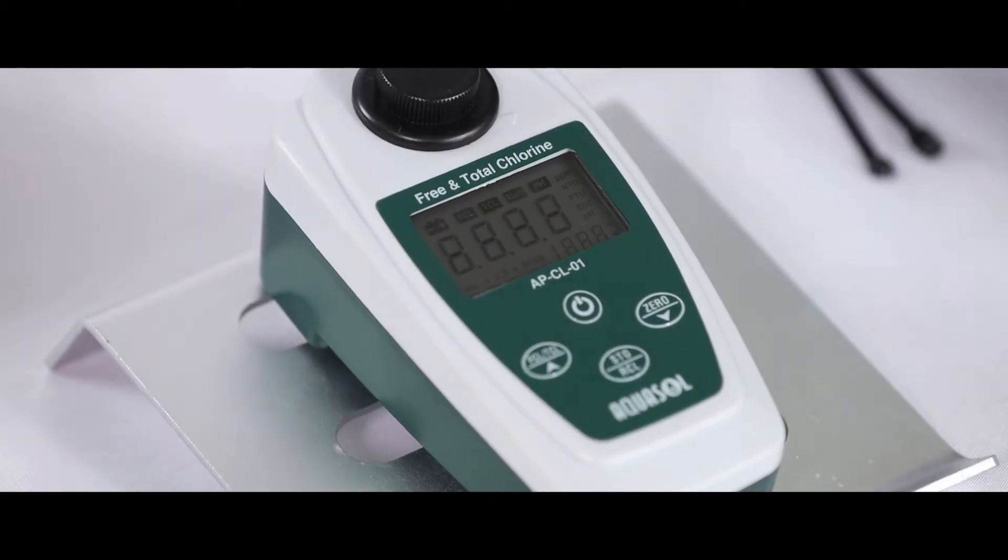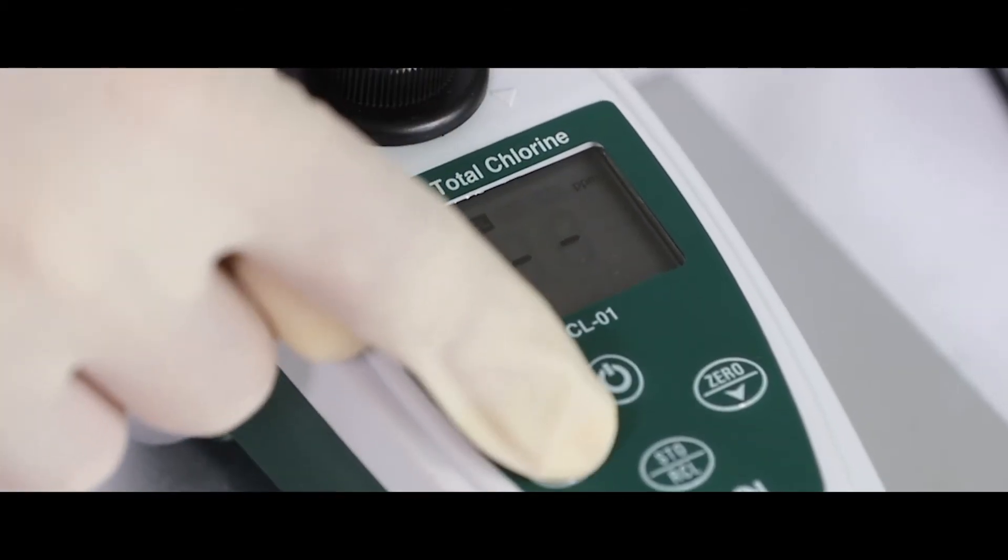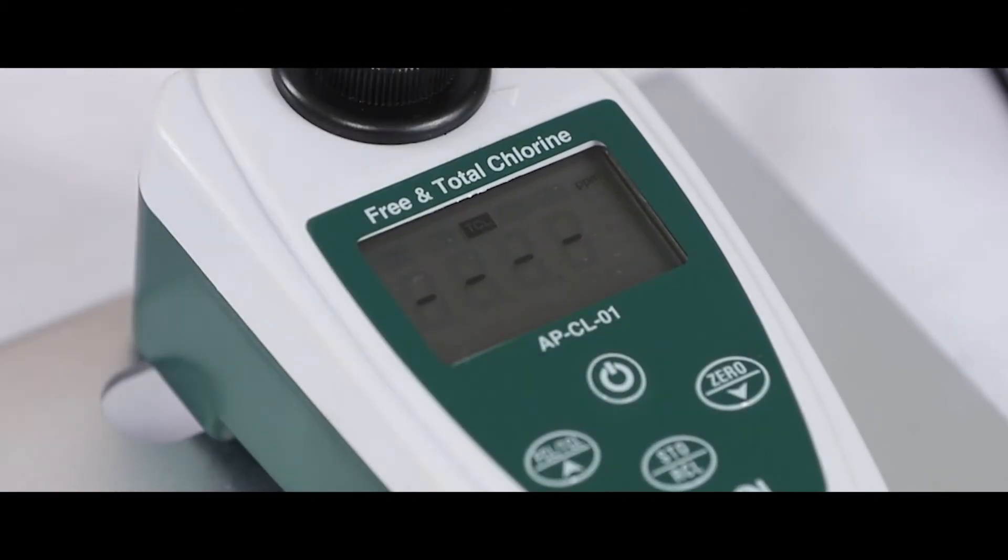Press the power button to switch on the meter. Press FCL slash TCL button to change the mode.